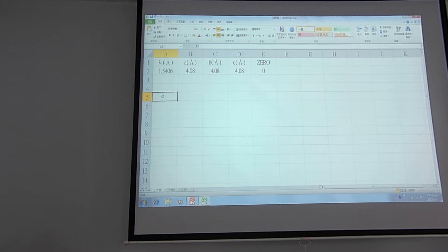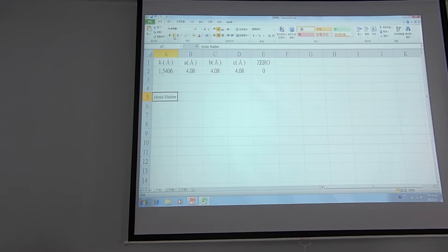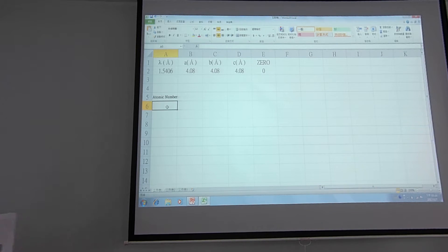From the equations, the scattering length is proportional to the atomic number. So I will insert here the atomic number. I will reduce the font size to 8 and use bold format. You can check your lecture notes — the diagram shows there are four positions inside an FCC unit cell, so you need to type four atoms here.